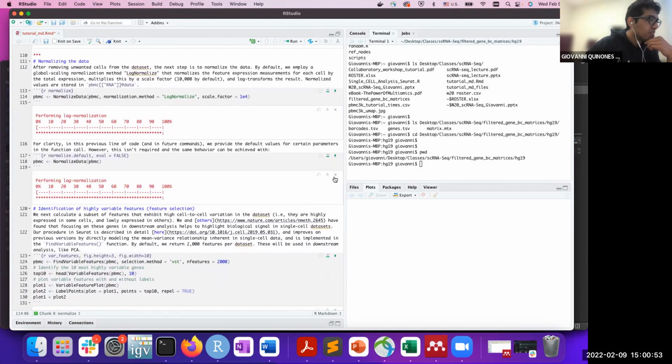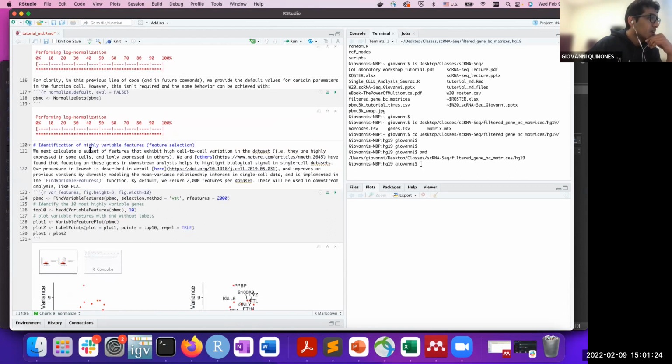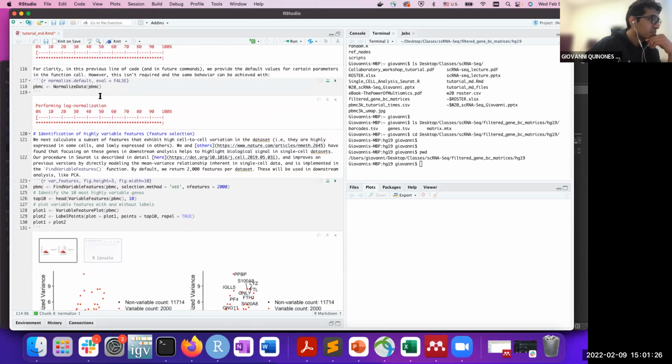This should convert our raw counts into the CPM. Well, the M stands for million, but in this case it's 10,000, so our CPT, well, let's still call them CPM values, will be stored in the pbmc object. And that's it for normalization.